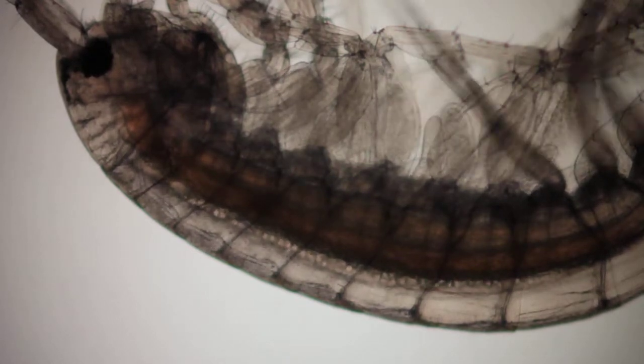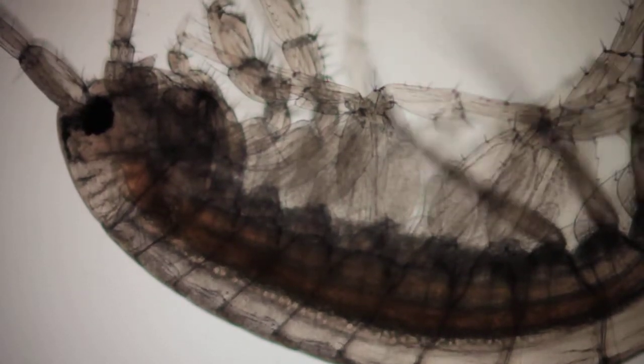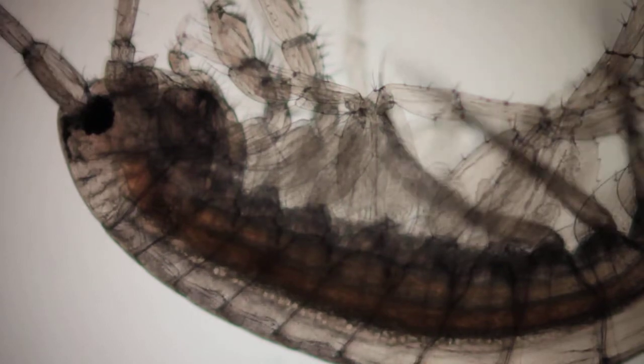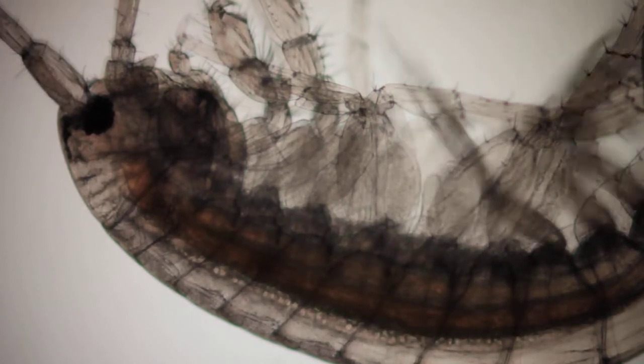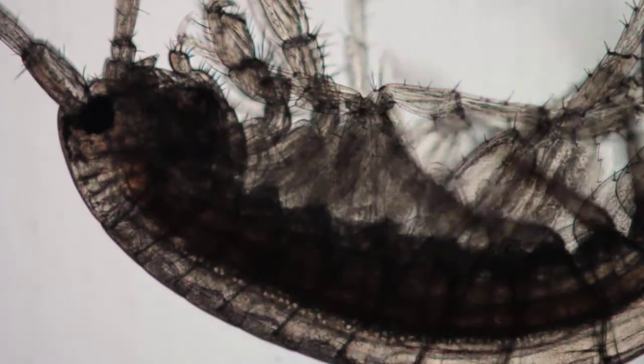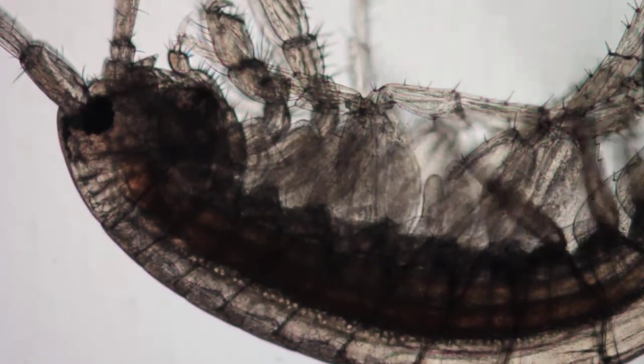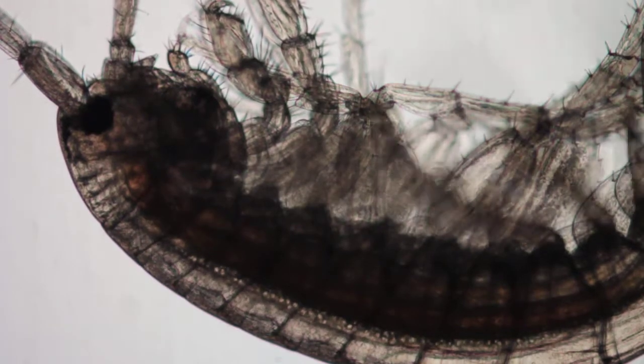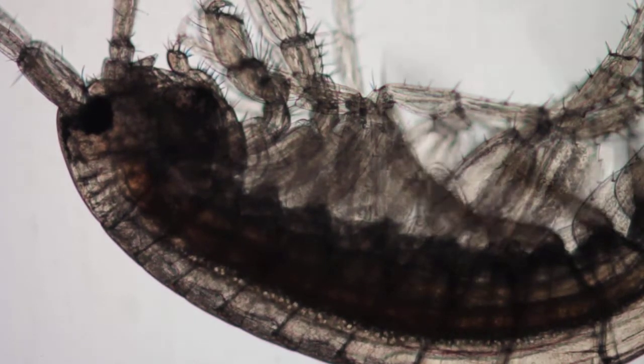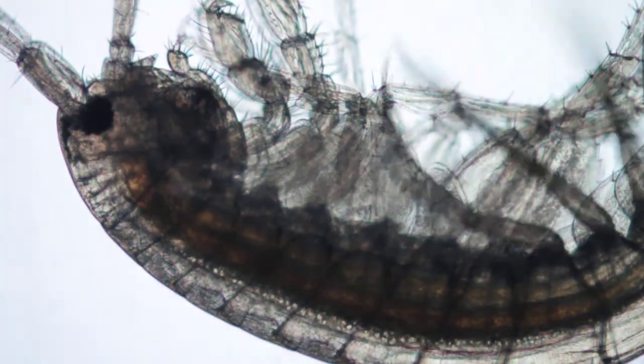This is a rather thick bug. You can kind of see right through and now I'm going to flip it down. See how it's harder to see through. The overall light is more even but it's harder to see the internal organs.